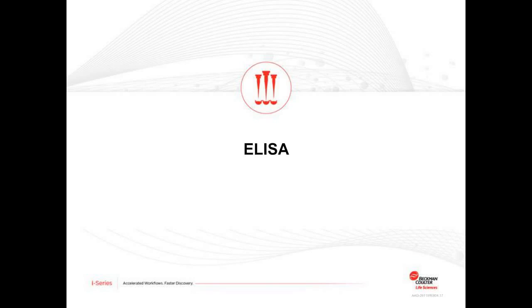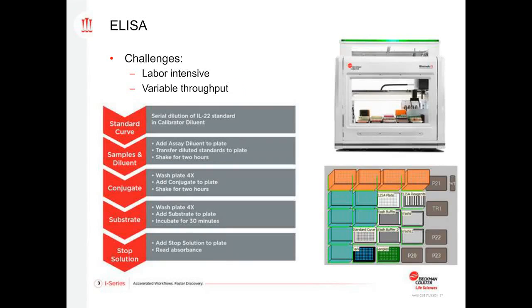So moving now into the cellular applications, we'll start out with an ELISA method. I think most people are familiar with ELISAs. It's obviously pretty ubiquitous. It is a fairly labor-intensive process, though, and shown on the lower left-hand side is the workflow that we used for our proof of principle work. This was an IL-22 ELISA kit that was commercially available.